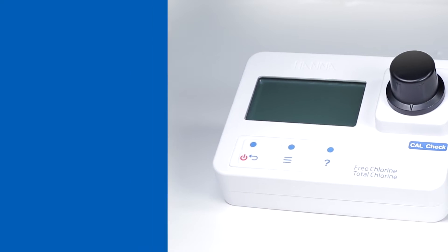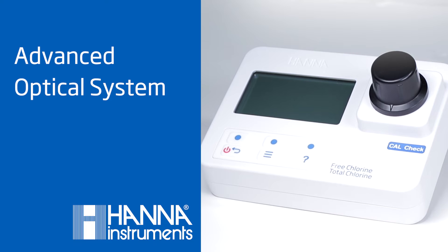The HI97711 has an advanced optical system for unparalleled precision among competing photometers in its class.